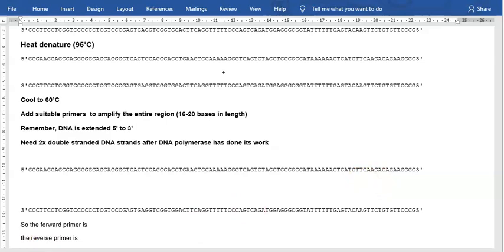So what I want you to do over the next few minutes is have a go and type in where you think the primers are supposed to go. Okay, have a go at it. Let's see for yourself whether you get it right or wrong. Don't worry, I'm going to take you through the correct answer in a few minutes. So pause the video, have a go at the sheet, draw on your primers, and then restart.